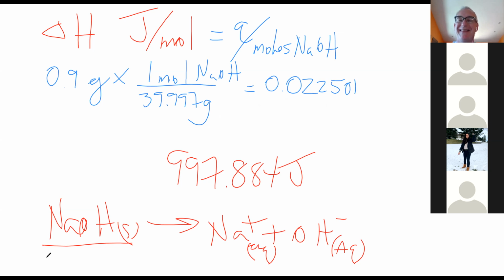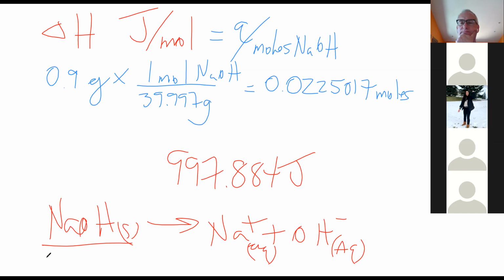250168. I think that's probably enough. Here we go. Yeah, so that many moles. So what's my delta H? Divide the joules by the moles. Yeah, I divide my, well, which joules? What joules?